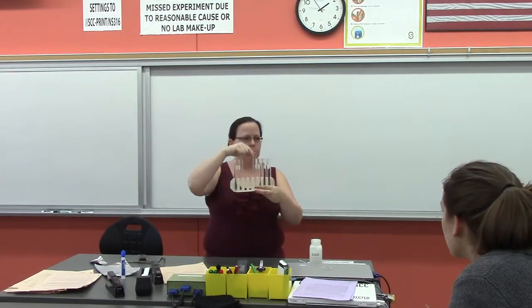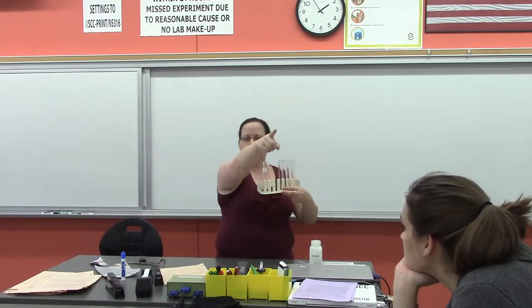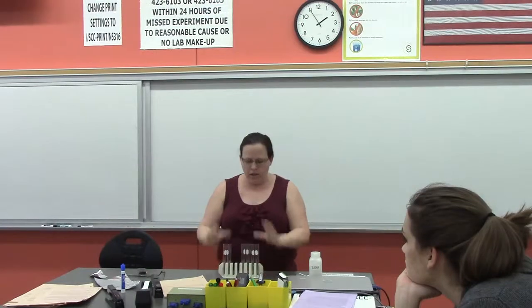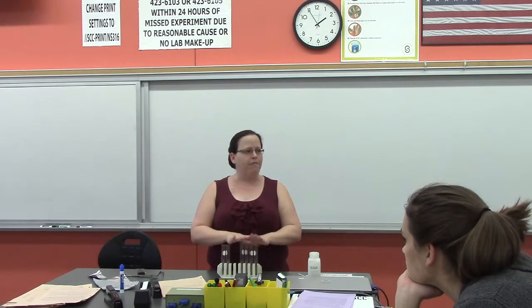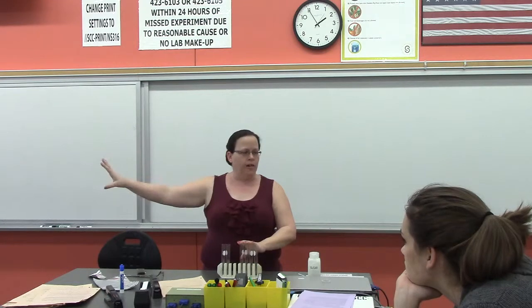Remember, anything that's blue is going to go into the back fume hood back there. Any other liquids are going back into the beaker that's for liquids in that back solution. When we wash any glassware, whether it's test tubes, beakers, anything like that, we always want to dump out what's in them first into the appropriate waste container. Then we go to the sink and we wash them.